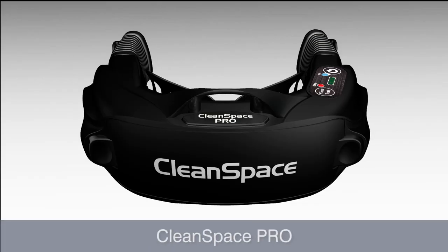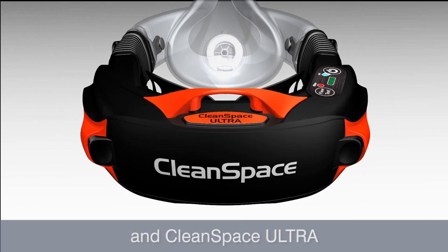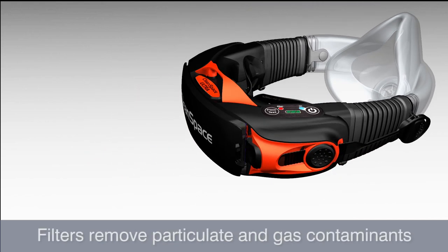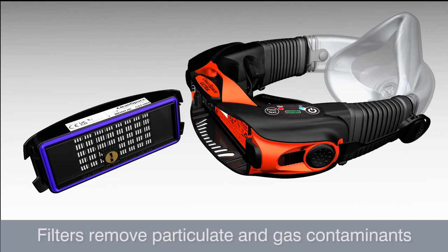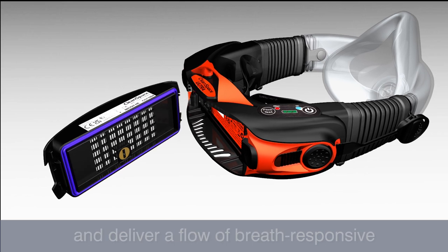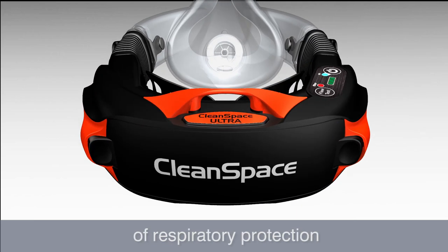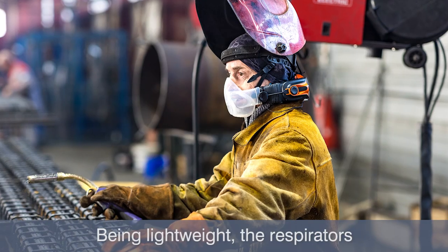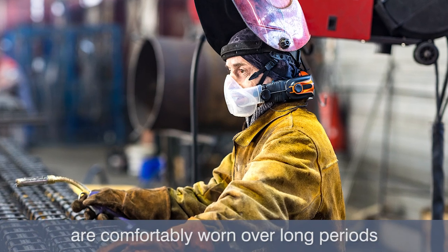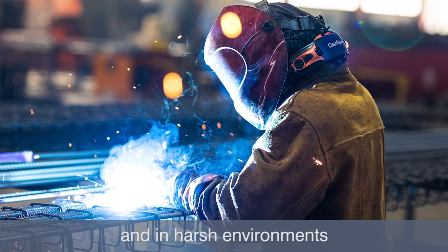There are two models: CleanSpace Pro and CleanSpace Ultra. Filters remove particulate and gas contaminants from the atmosphere and deliver a flow of breath responsive fresh clean air. CleanSpace provides a very high level of respiratory protection.